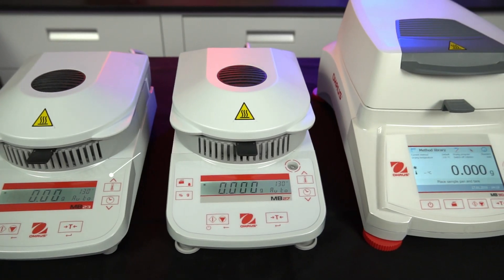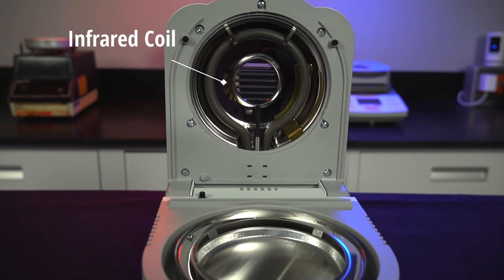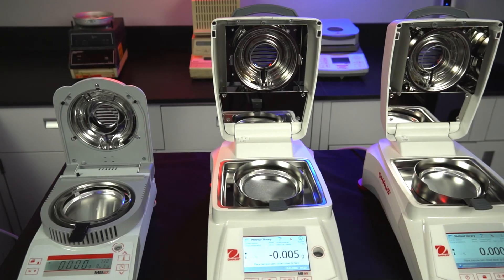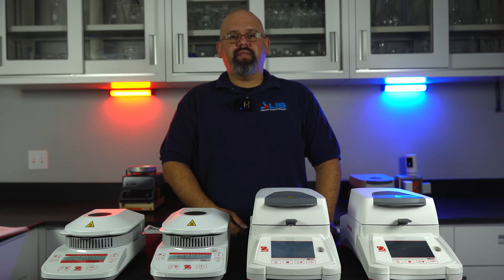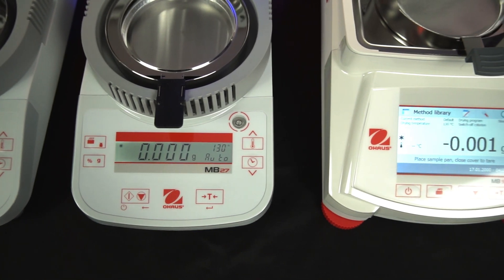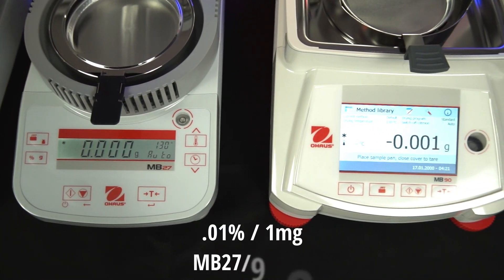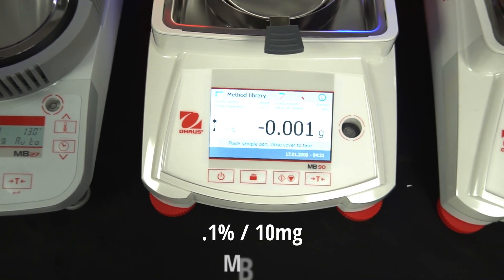The latest models in the MB Series are the MB-23, MB-27, MB-90, and MB-120. The MB-23 uses an infrared coil as its heating source, while the 27, 90, and 120 all use a halogen lamp. As mentioned earlier, the halogen heat source is faster than infrared, so those three models are faster than the MB-23. They are also much more accurate, with the ability to read 1/100th of a percent per 1 milligram in moisture content, while the MB-23 does 1/10th of a percent per 10 milligrams.